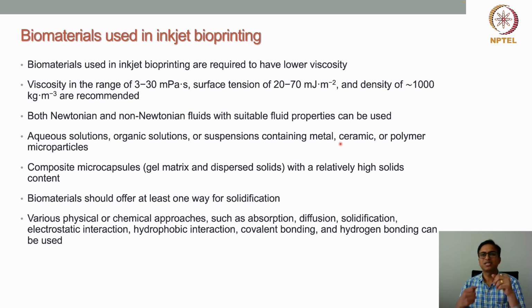But when we talk about inkjet 3D printing, what happens? Because of the nature of the process, during printing, when they are inside the nozzle, they should be in the solution or liquid state, right?